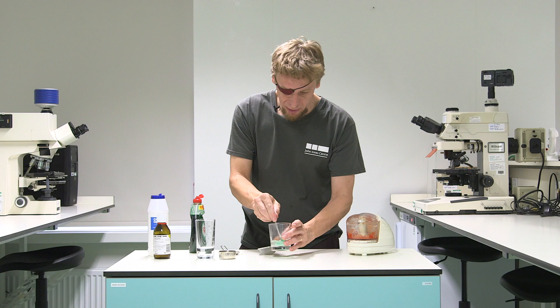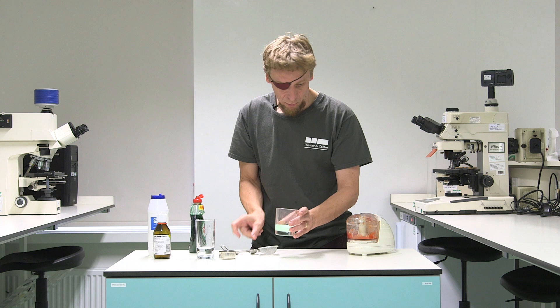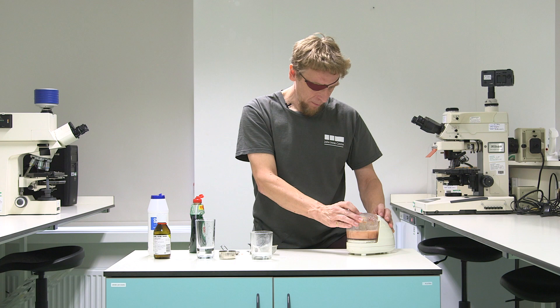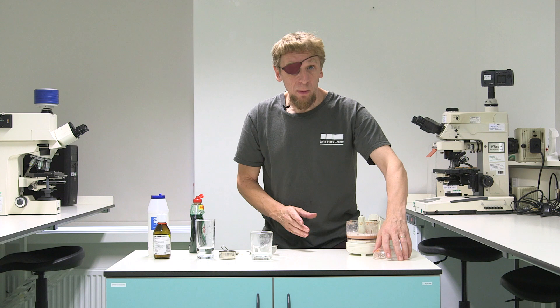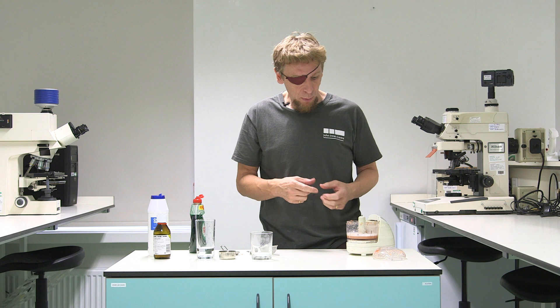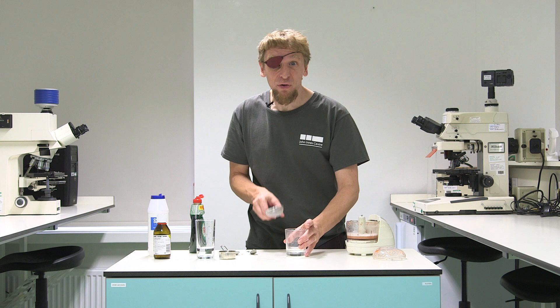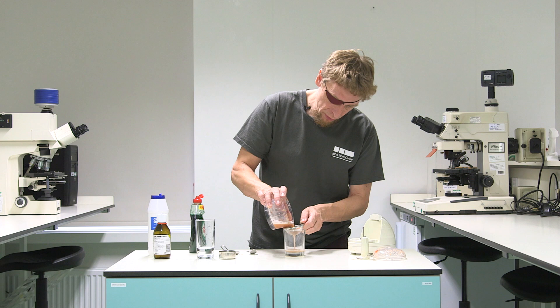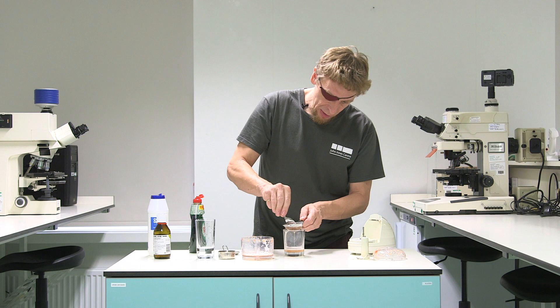Give that a little bit of a stir. So I'm just going to add that into my tomato mixture and we'll blend that up. So inside here I've got my tomato and hopefully we've broken down all the cells so the DNA can escape, but we've still got some quite big bits of tomato in there and I want to get rid of those, so I'm just going to put it through a little sieve. Just pour that through and give it a little bit of a stir.